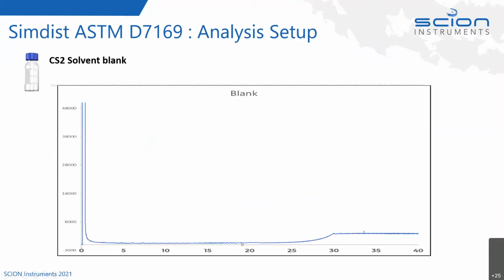This is important, just as important as having the solvent at the beginning: we want to have a good repeatable solvent blank while running this instrument. And we want to have a good bleed profile that's consistent. We want consistency with the blank because we're going to subtract the blank. The blank is important because we're also adding carbon disulfide to the crude oil sample to enable it to be injected into the GC. So if we have a consistent blank, our subtraction signal will be quite accurate and reproducible for our crude oil samples themselves.